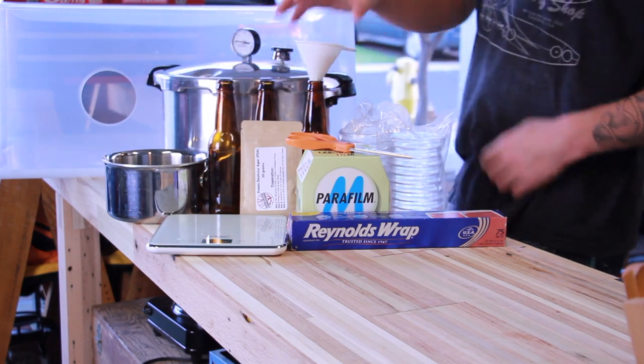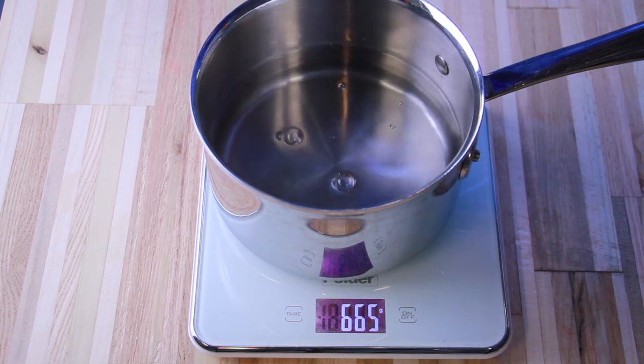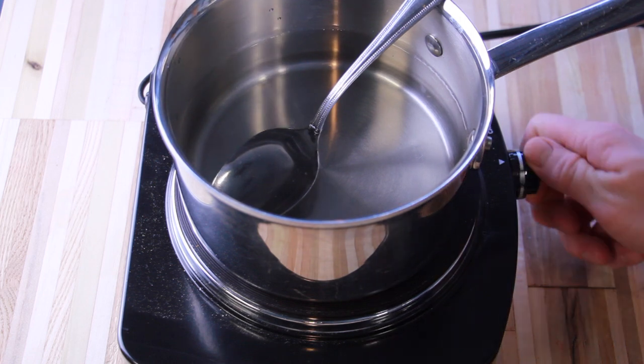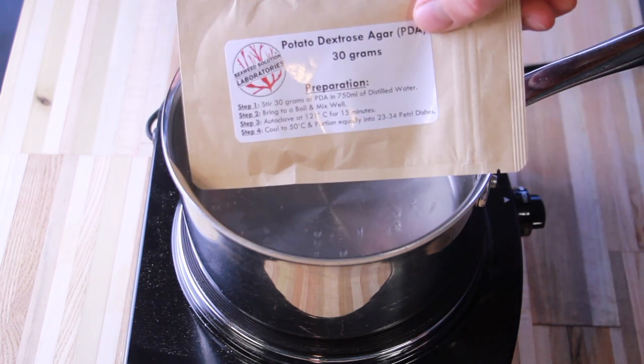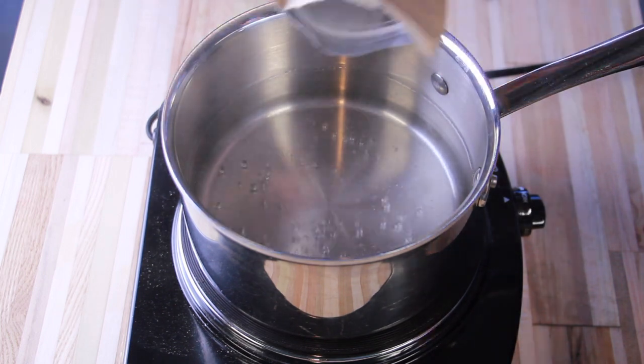So the convenient thing about water is 1 milliliter of water weighs 1 gram. So 750 milliliters is 750 grams. Now take a quick look here at the directions. I obviously didn't read the directions well enough because I started boiling my water first, and I bet you can guess what's going to happen here.